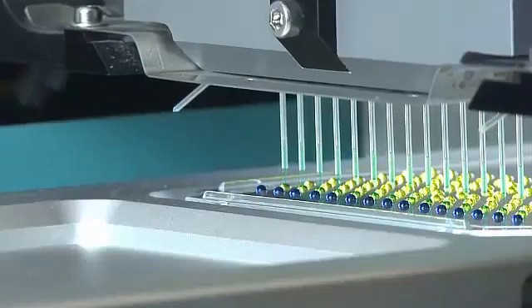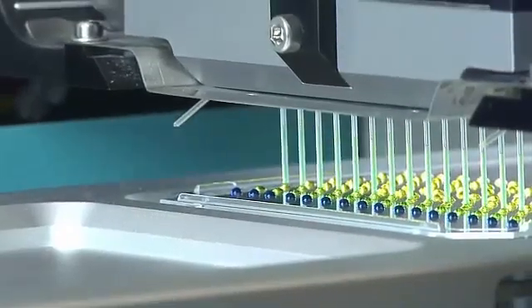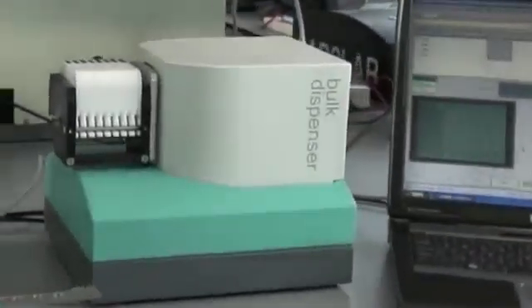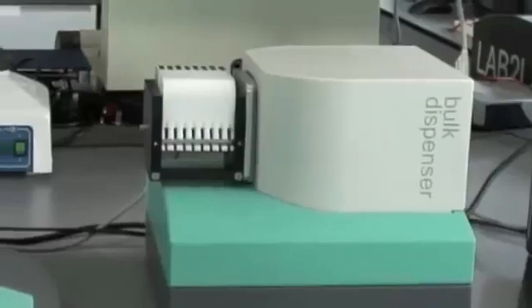We can then re-access that very low volume and stamp it out into one or more assay plates for a low volume assay ready dilution. The Mosquito bulk dispense module allows high volume additions to be made in conjunction with the low volume additions that the Mosquito head can make.